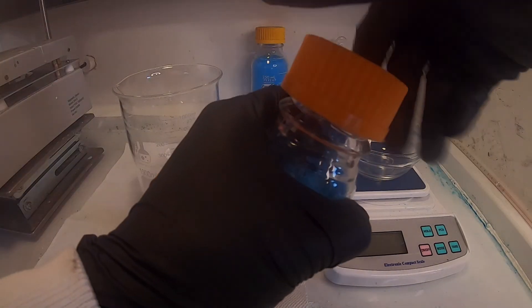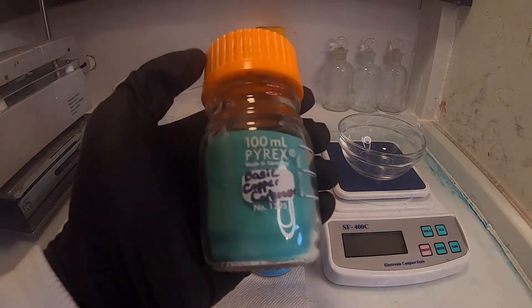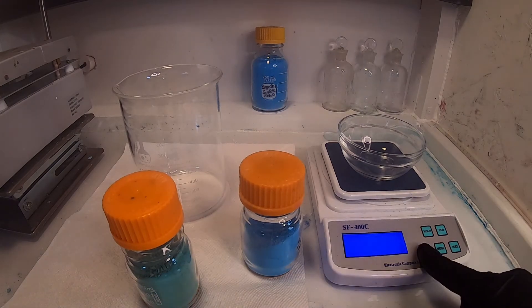Hello fellow alchemists. Today I will be creating copper acetate. This compound forms beautiful blue-green crystals, and it is also a useful oxidizing agent.